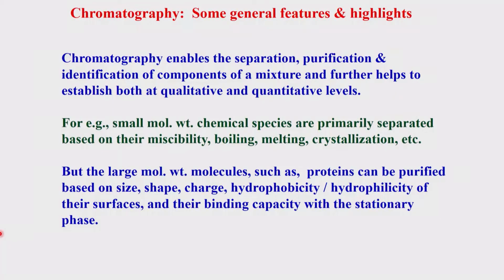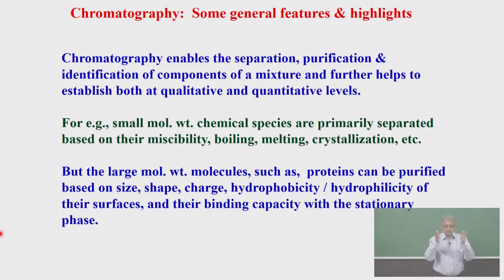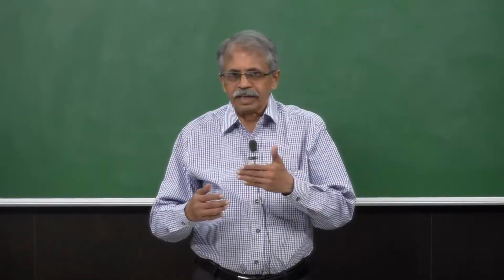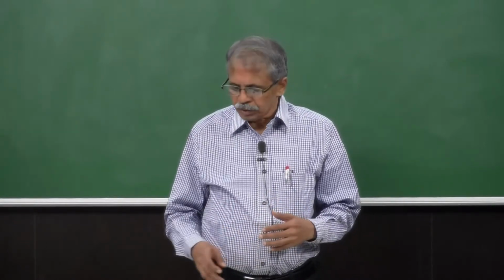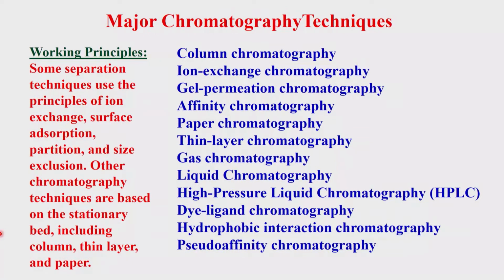Okay, so these are dependent on their size, molecular weight, they are different in shape, size, molecular weight, charge, the hydrophilicity and hydrophobicity of their surfaces, and their interaction towards certain species. For example, with the stationary phase, you have some kind of an interaction. All of these I'll be explaining in a little more detail as we keep moving across this particular topic. As I said, the separation techniques depend on the principles of charge, size, molecular weight, all of these.